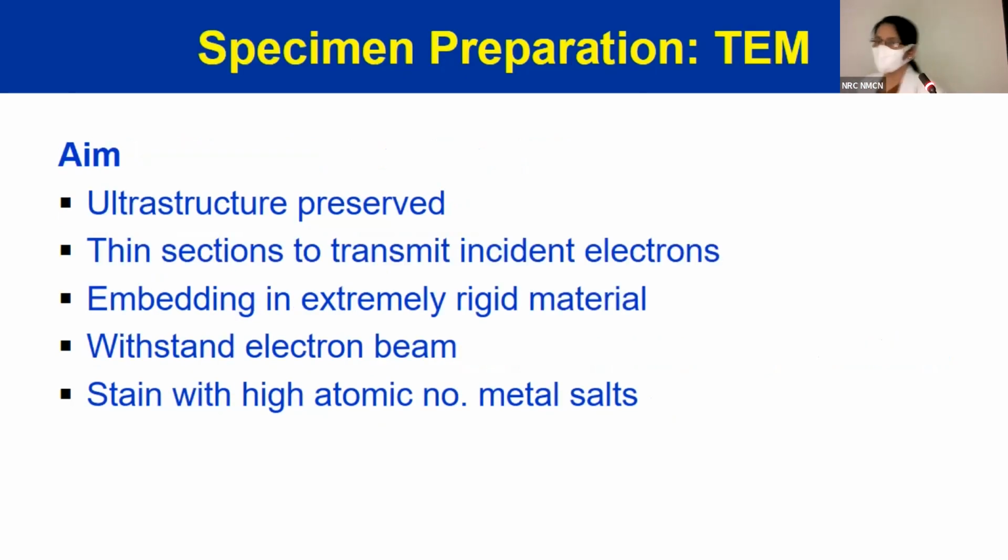So what do we need to have a tissue which can be processed for electron microscopy? What do you think? How do you take tissue for light microscopy? So you've done a surgery or someone has done a biopsy. Where do you keep it? What do you think?